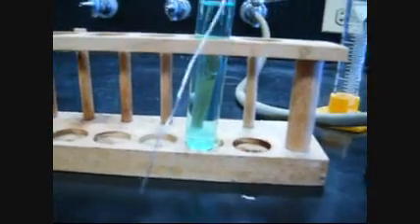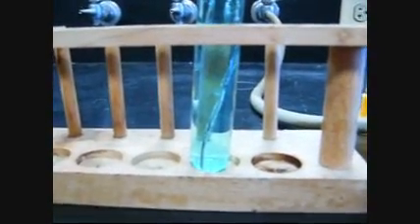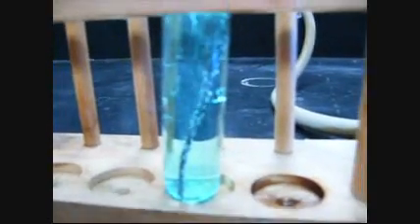Alright, now for the last part of this experiment, last reaction, we're going to add a piece of aluminum wire to the test tube. Let's see if we can see anything happening here. First thing we see are some bubbles forming on the wire. So the wire is bubbling. Now notice, we are not heating this up on a burner, and yet bubbles are forming all along the wire.